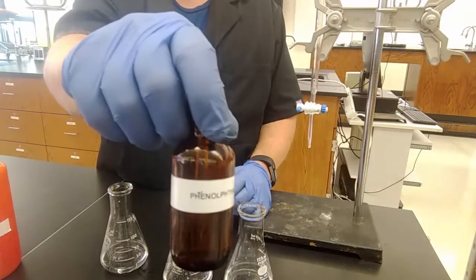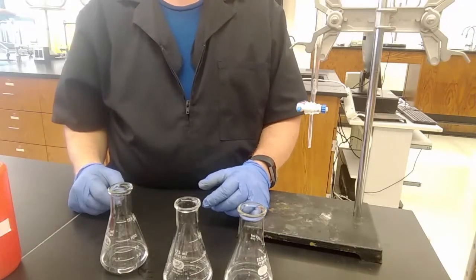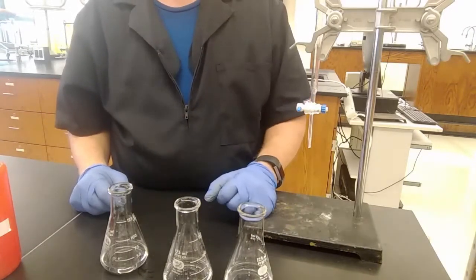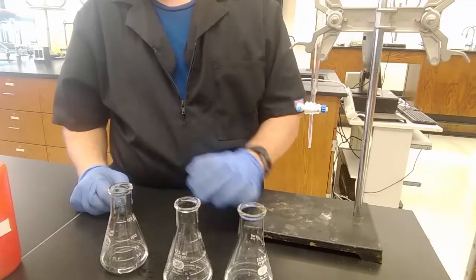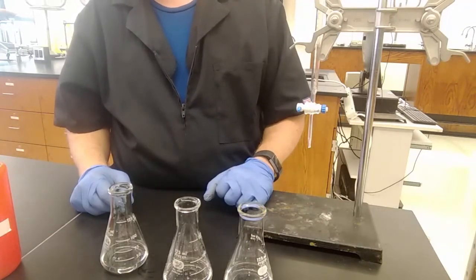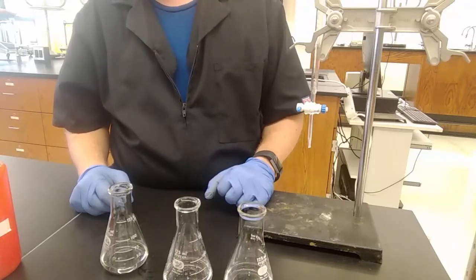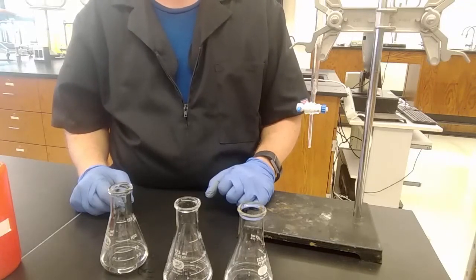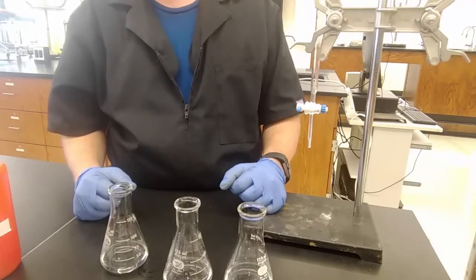Because acid-base indicators are themselves acids or bases. And so if I add a whole ton of indicator there, I'm adding extra acid. The question in the book says, what happens if you forget to add the indicator? Well, actually, the second question was, and what is the harm in adding more than 2 drops of indicator? I already answered that one. But the first question, what happens if you forget to add the indicator? No color change. You can't tell when the acid has reacted with the base.